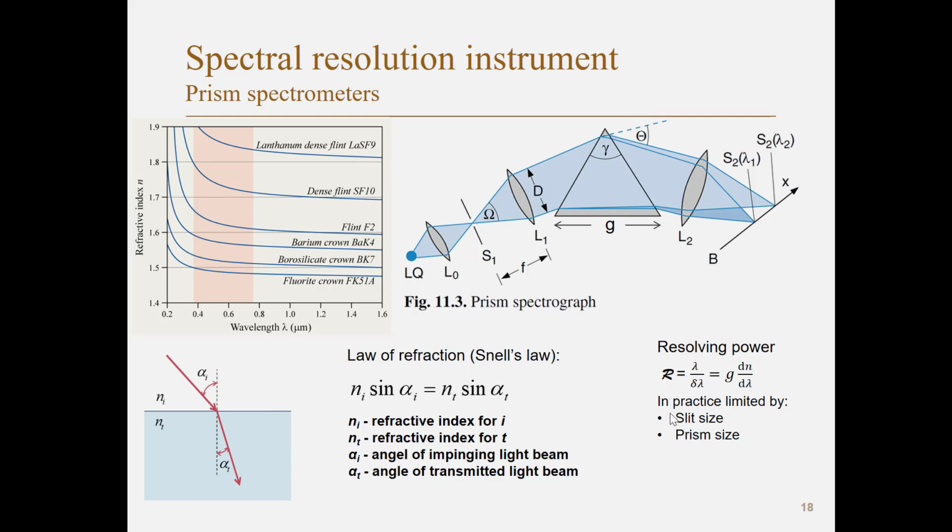And it's limited by how small this slit is, but of course then you get less light through, and also by the size of your prism, how large your prism is.